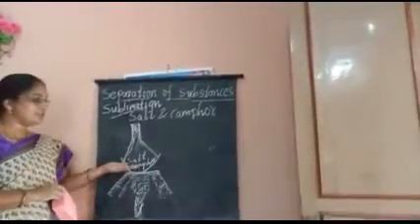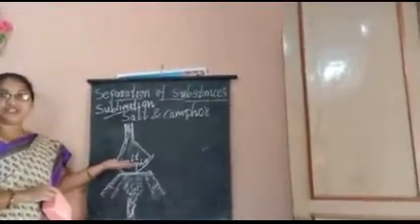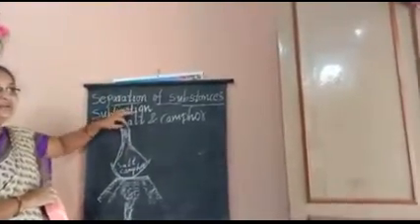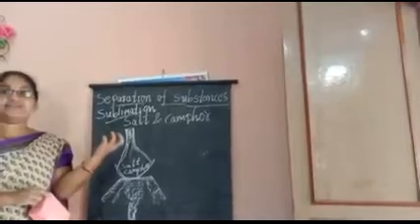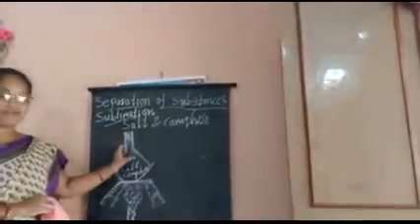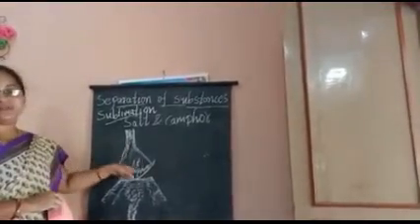What happens when we heat camphor? Camphor is in the solid state. On heating, it directly converts into the gaseous state. We are plugging some cotton here so that the gaseous camphor is not allowed to go out, so the camphor vapor sticks to the walls of the funnel.